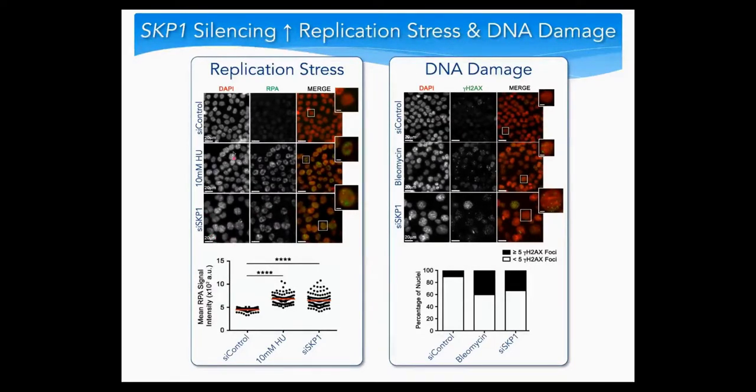And indeed, you can also see the increased sizes of those nuclei relative to the control. And of course, Laura went on to quantify that, and those increases in RPA labeling are certainly statistically significant. Moving forward, she also did a very similar approach for DNA double-strand breaks. She used gamma H2AX, which is a surrogate indicator of DNA double-strand breaks.